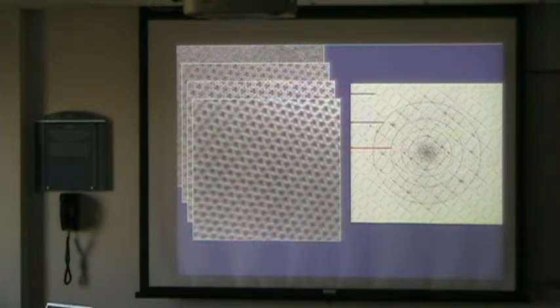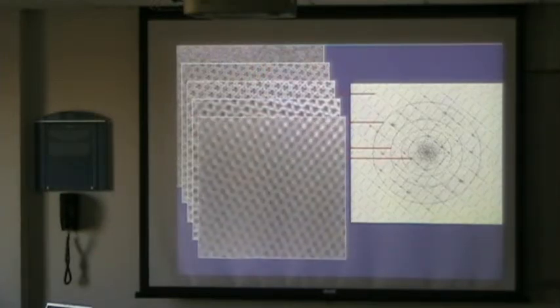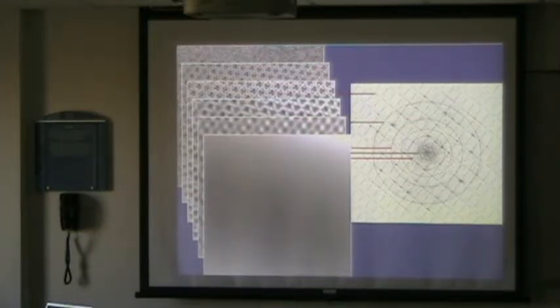This, by the way, just to tell you what this is, a porin crystal. That's a bacterial porin. And that's a trimer, which has 3 holes. 3 relatively open holes in the outer membrane of a bacteria. So it's not a very specific kind of channel. It's just an open water channel. Well, anyway, so that's what this molecule is. But here you see we lose this 3 hole. This is the trimer here. And we have that not anymore. It gets even worse here. It gets really bad if you only take the center. So there's no information in the center anymore. Anyway, that's a good thing with crystals, so we can play around with these kind of things.